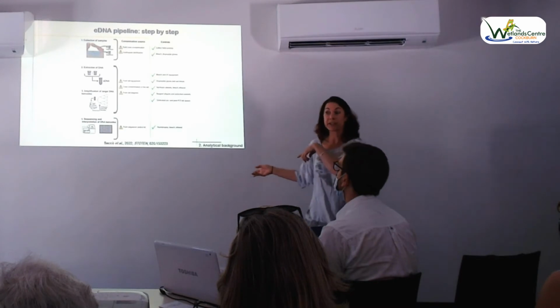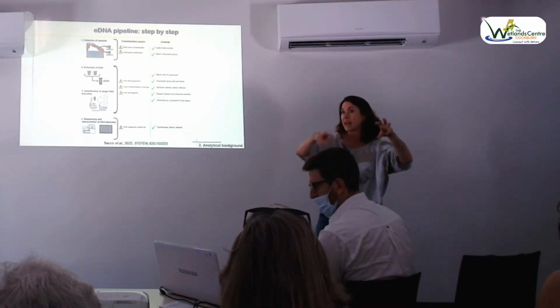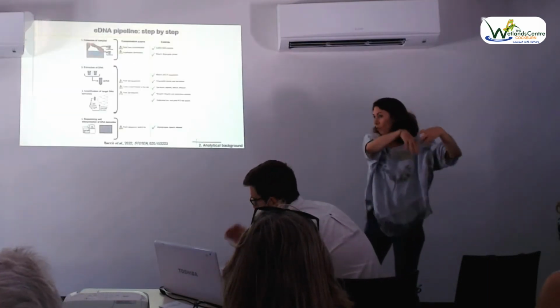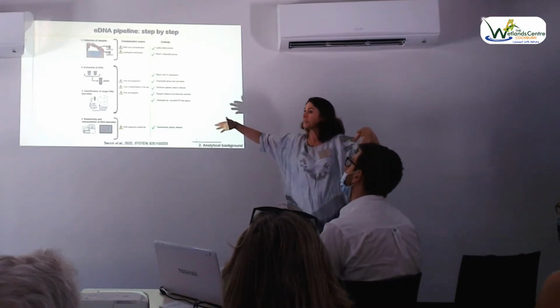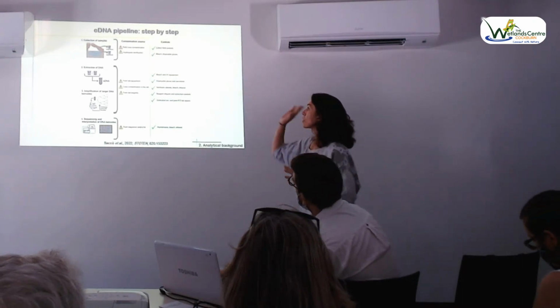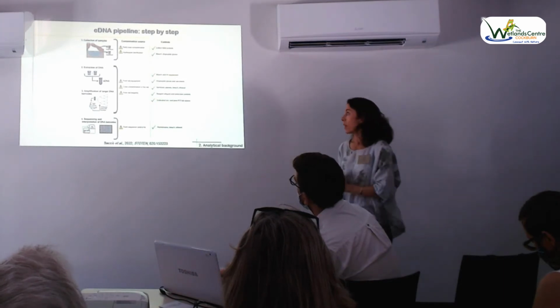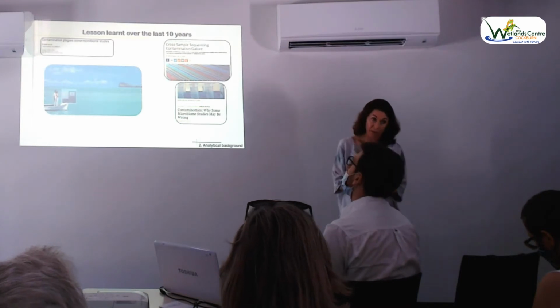Then you can falsely interpret your results, thinking you found invasive species in X number of sites, when really the invasive species may have only been at site 1, but you didn't clean your equipment, so you carried the DNA across all the samples. Extremely important. So we have a lot of controls that we put in place when we're doing environmental DNA work, and that starts right in the field.